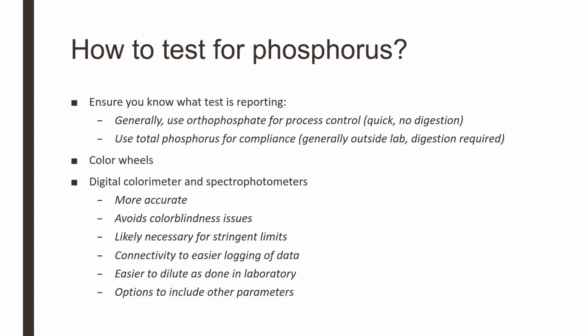Another thing with the colorimeters and spectrophotometers is that almost all of them are going to have other parameters that you may need to be testing for. So that's much better than the color wheels, which are all, everything I've ever seen, has been a single test product.